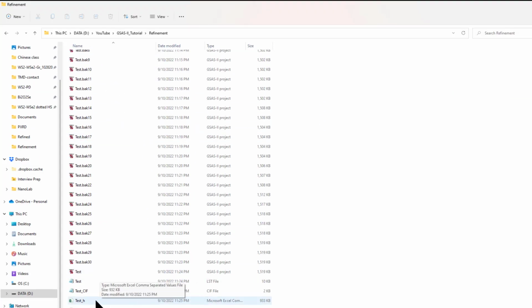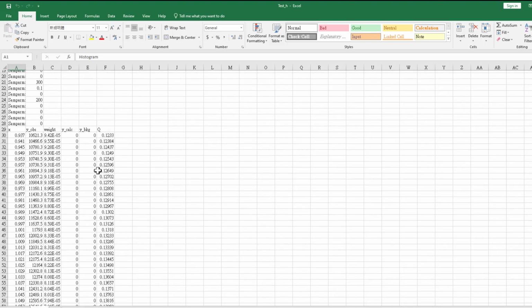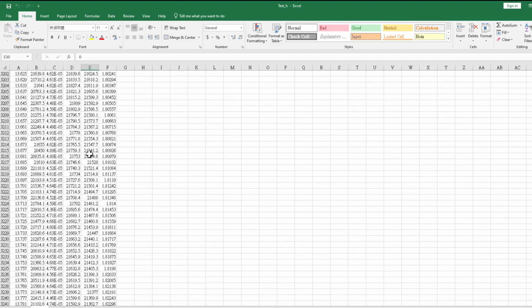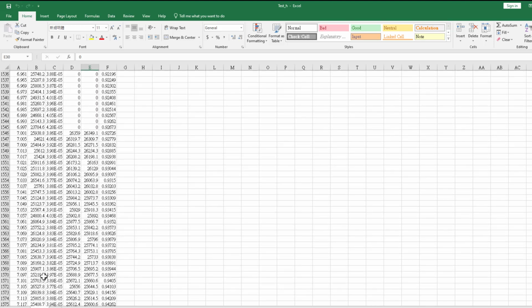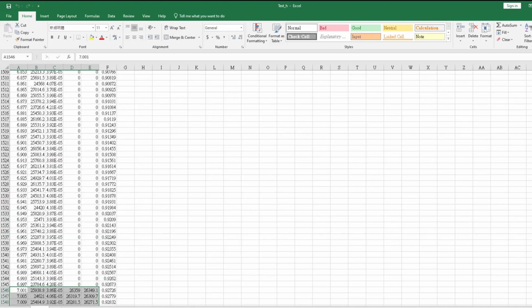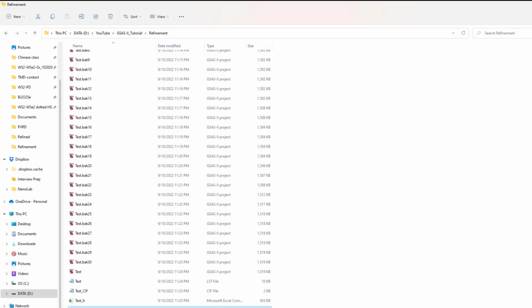So now we have exported a few files, and if you open this H, it is a histogram. What is in this histogram file is the X value, the Y value is the intensity, and the calculated spectra, and then this is your background. Remember that we limited our refinement between 7 and 29. So you can see over here, this is 6.99. We start from 7, so you can start to see data coming. Anyway, this is about the histogram.